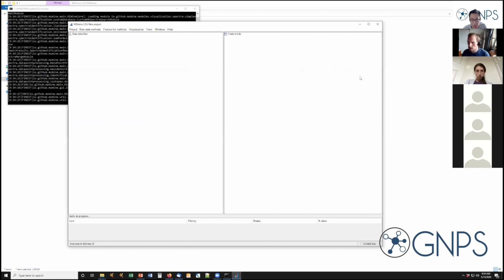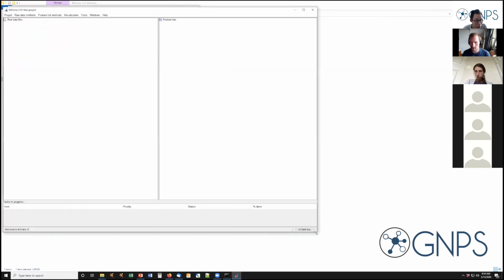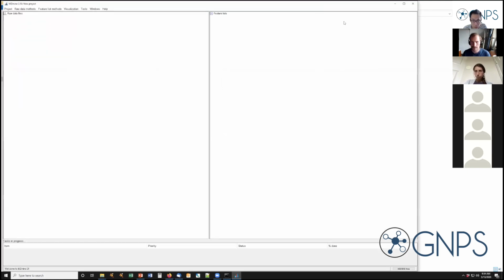Maybe to get some feedback, who managed to download that and has this open right now? Or maybe better in reverse, who could not download this?